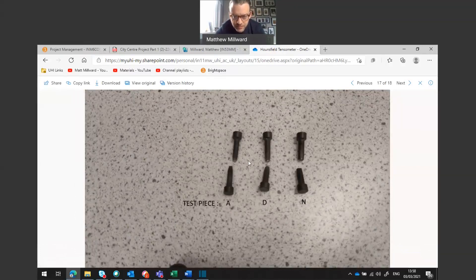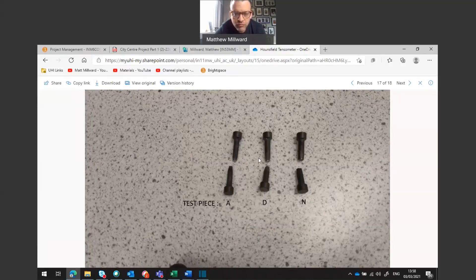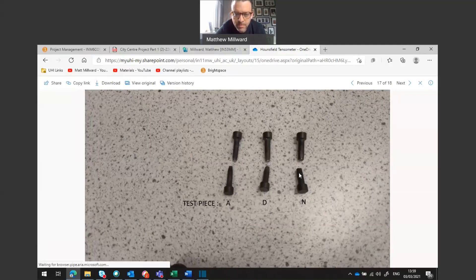These are the sample sizes at the end. You can see sample A here — the reduction in area compared to sample N. Sample A had 0.1% carbon whereas N had 0.8% carbon. You can see the effect of more carbon reduces the ductility of the sample. The original sample has a gauge length of 25.25 millimeters and an original gauge diameter of 5.05 millimeters.